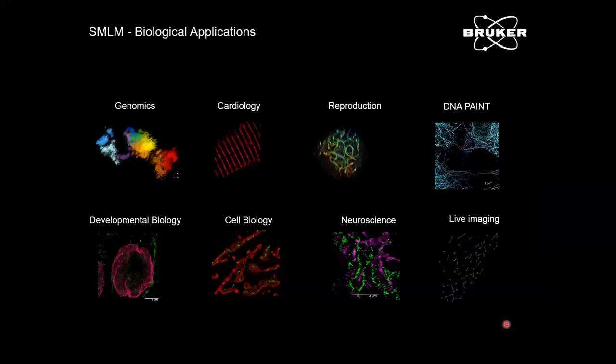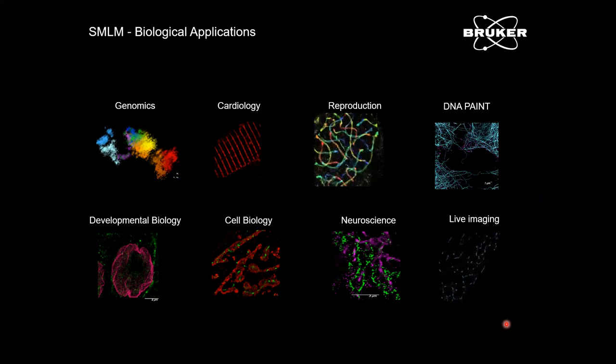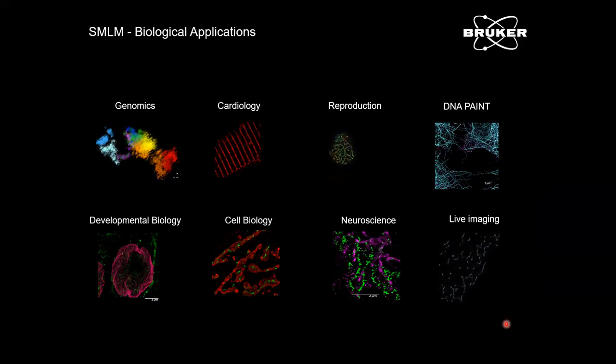The flexibility the Vutara gives you in terms of sample type makes it suitable for a variety of biological functions. For the remainder of the talk, I will focus on multiplex imaging related to DNA PAINT and genomics imaging using Oligo-STORM and ORCA.